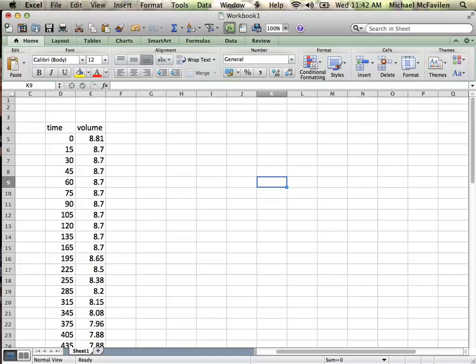Okay, so what we've got here is, first off, thankfully Emily and Danny went through and gave us some data, so hopefully we can see this. We've got a time value and volumes. So one of the things I want to address first off would be the time values.